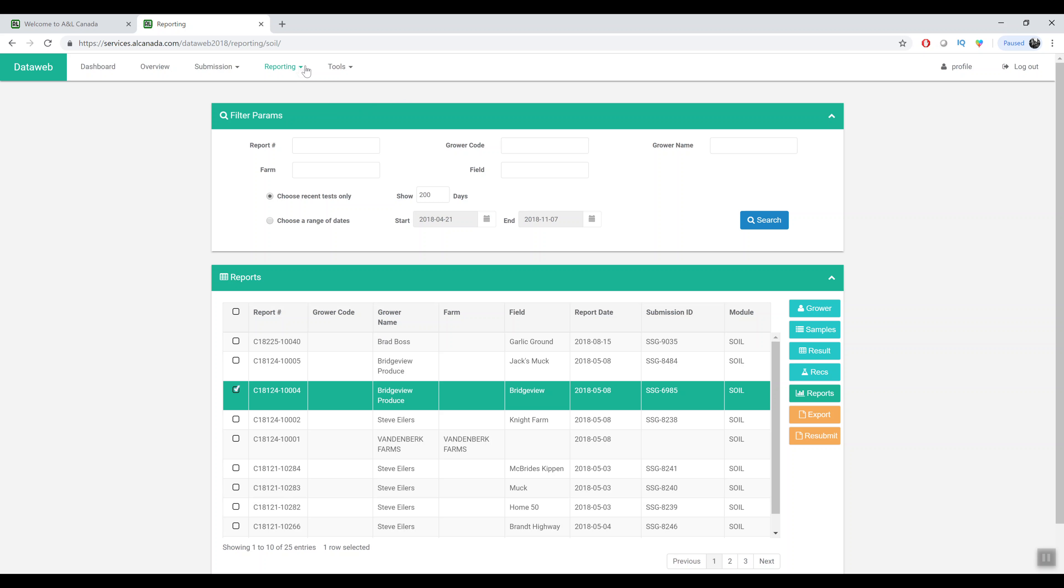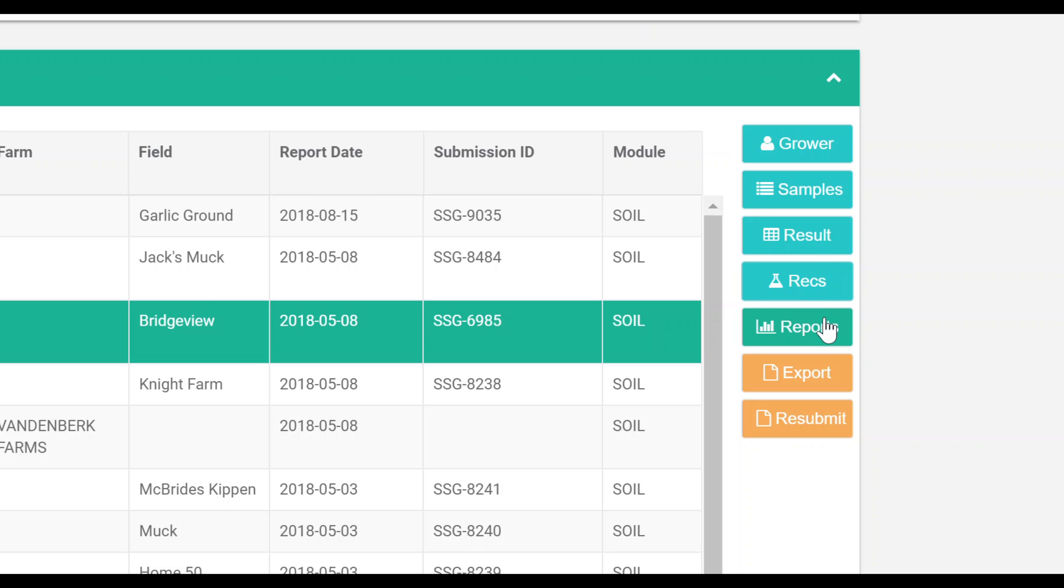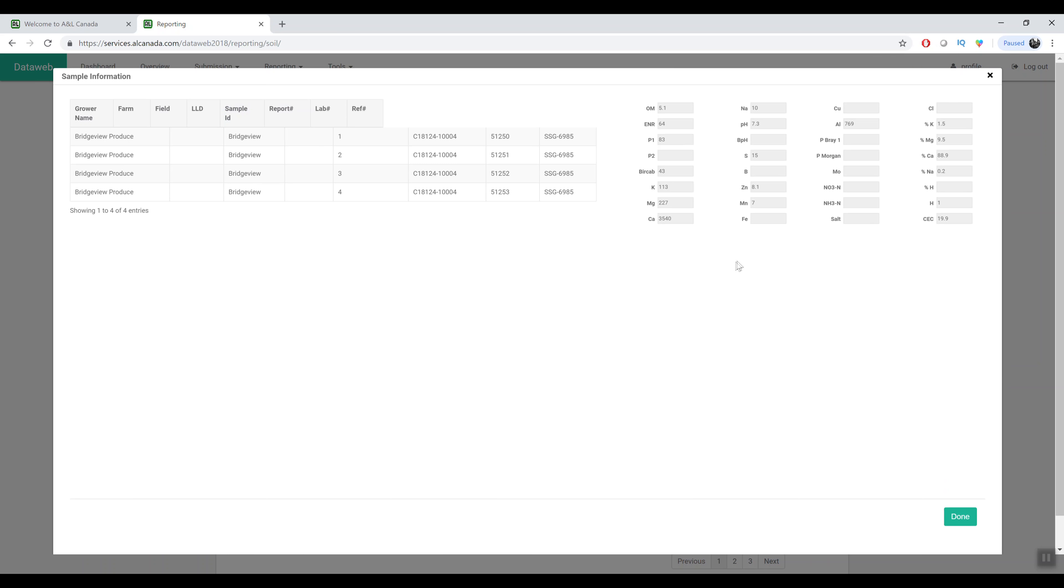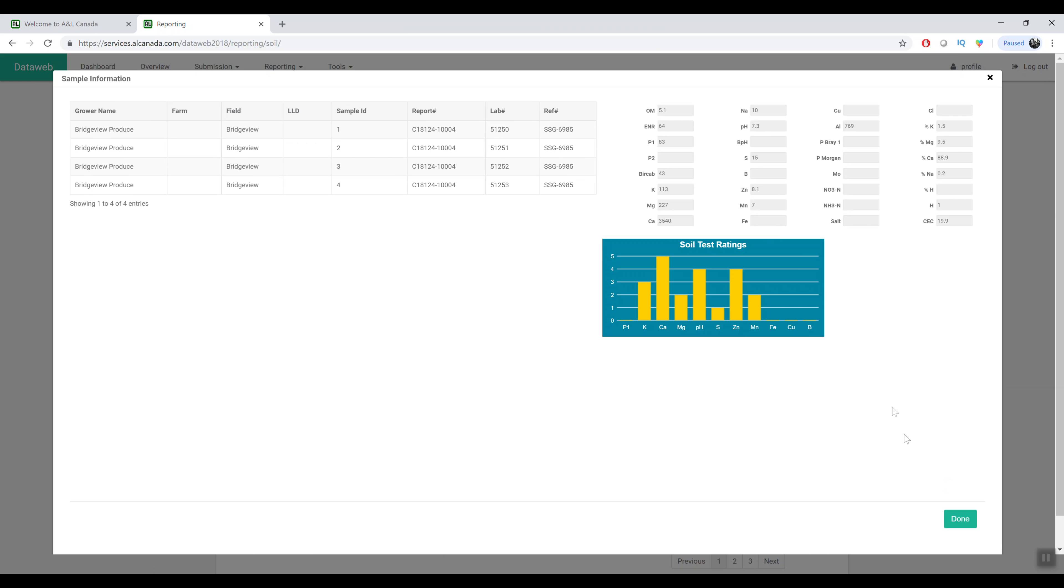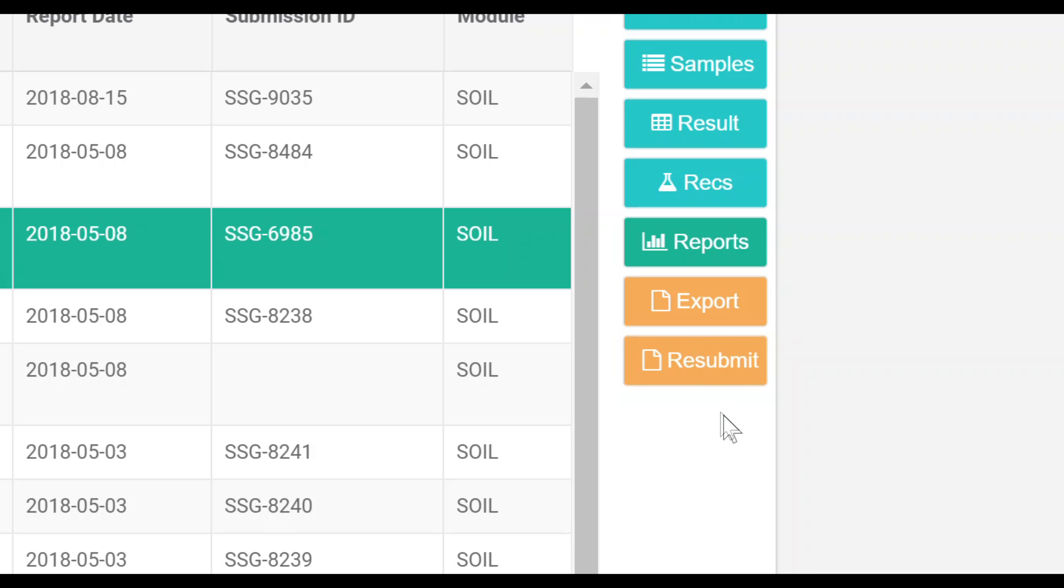And you have all the other options that you had on the current system with being able to change grower name, sample IDs, viewing your results, exporting. A new feature we've added is to resubmit that. So if you wanted to resubmit the samples for this field you can do that right from this screen.